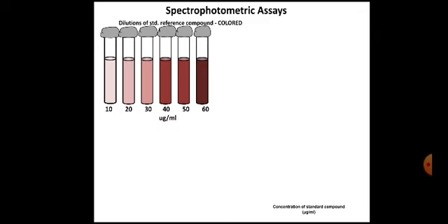So it is a different exercise. Already we know that for riboflavin a particular wavelength is selected based on earlier study. So that wavelength within the visible range of light will be used. After that, measure the optical density of all these tubes at the specific wavelength. What is that specific wavelength?